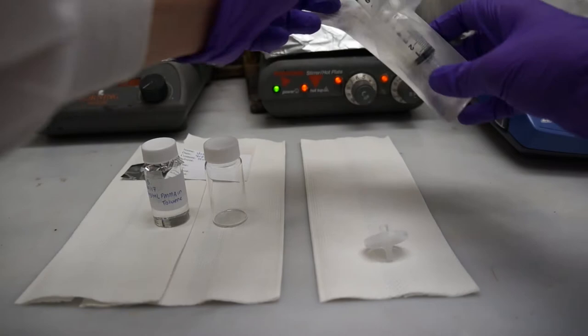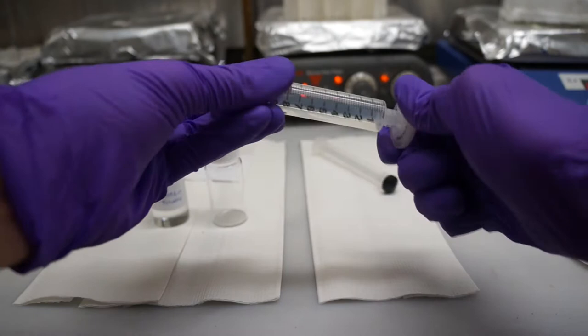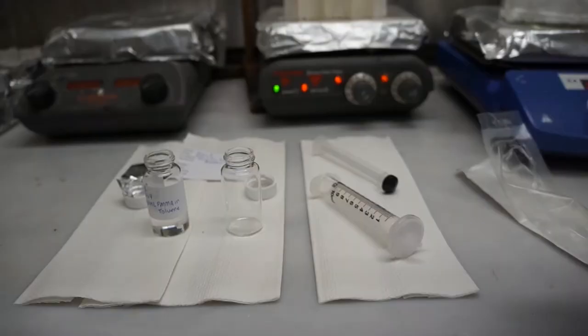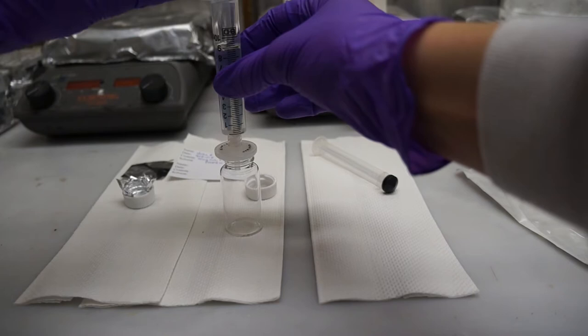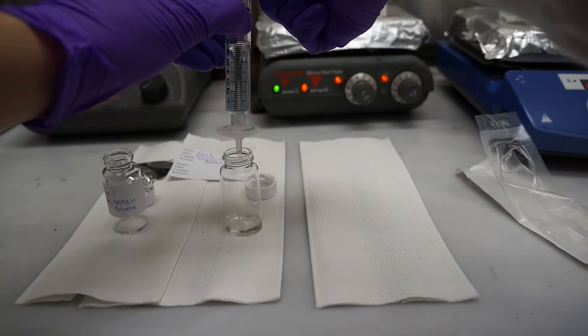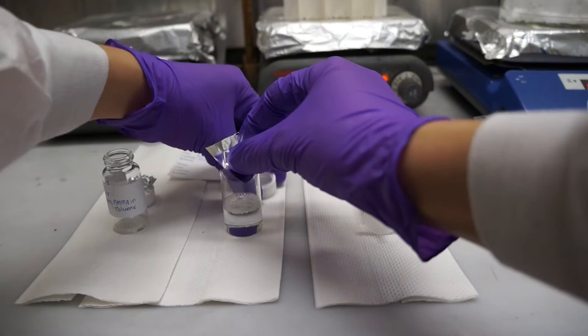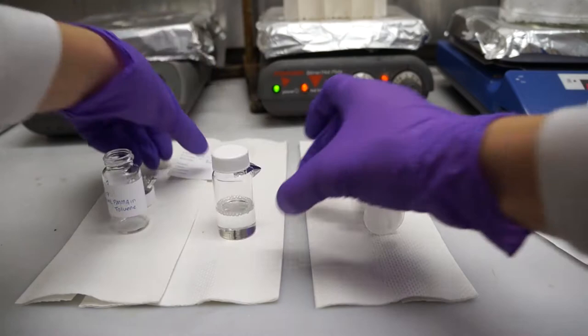The next day, we can return to the hood with our fully dissolved PMMA solution, a new scintillation vial, a syringe, and a filter attachment for the syringe. After attaching the filter, we can pour our solution into the syringe and push the solution through the filter with the syringe's plunger. This is done to filter any foreign particles that may have gotten into the vial out of the solution, so that we can minimize imperfections or irregularities in the thin film we will eventually make. Place a piece of tin foil between your filtered solution's cap and vial, and don't forget to label your sample.